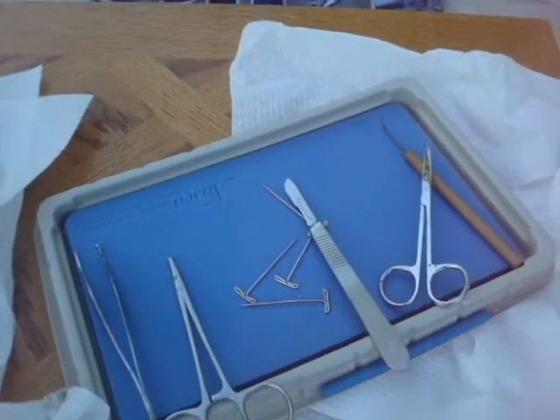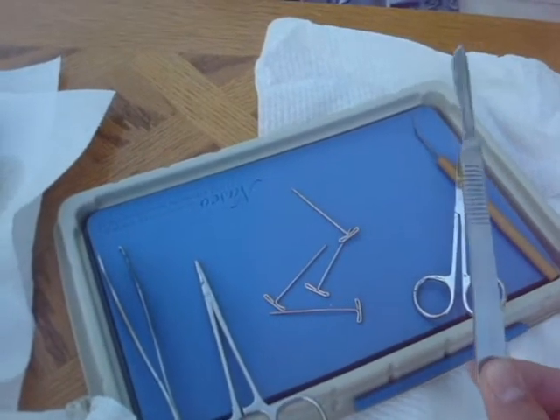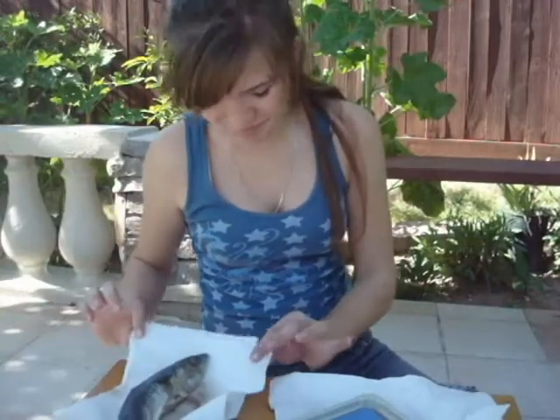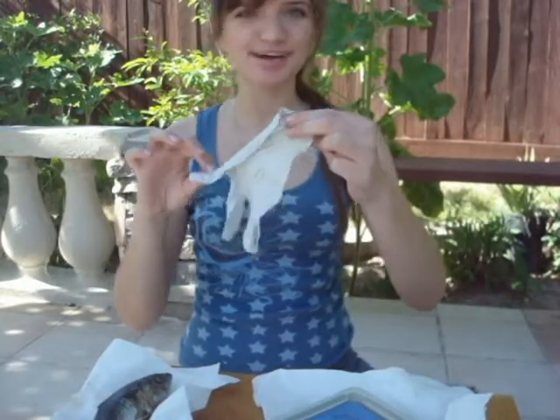Now if I was in a surgery, I would have about 10 to 15 more different instruments, different sizes of knives, more pins. And now that we have everything ready, including our really smelly fish, but before we start, we shall have to — voila — put on some gloves.